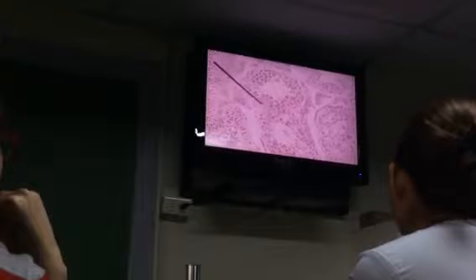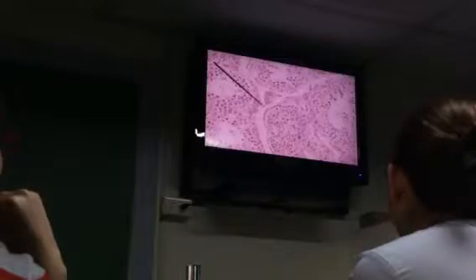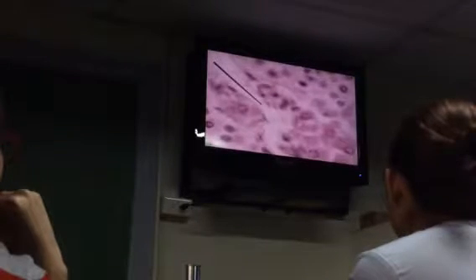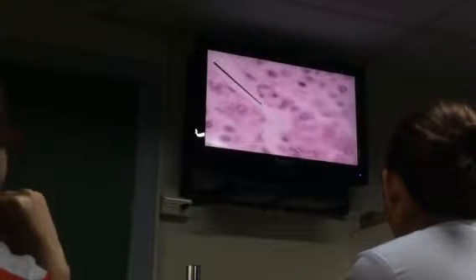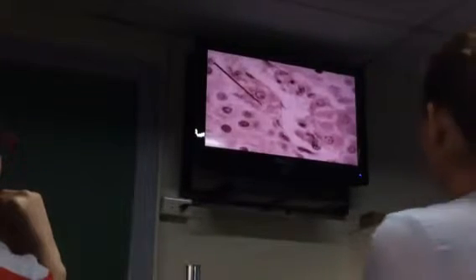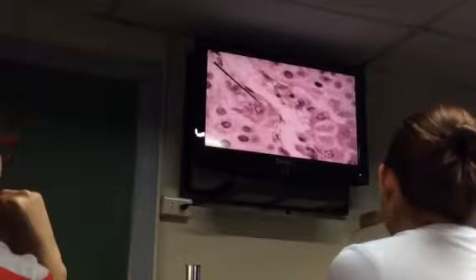There you go. And those cells over here, highly eosinophilic. But on high power, you will see large, highly eosinophilic cells. Okay? So those are your Leydig cells. All of this, Leydig cells. And of course, as is well known, this produces testosterone by the stimulation of your interstitial cell stimulating hormone. The next slide is the ovary.